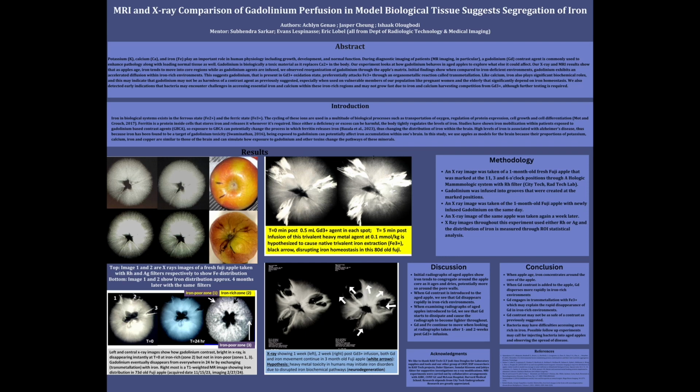After 24 hours, gadolinium does not leave any noticeable bright patches in the apple. However, we can see that the effect of gadolinium on the apple is an overall increase in brightness of the radiograph. Follow-up radiographs were taken 1 week later and 2 weeks later to show a continued gadolinium and iron movement.